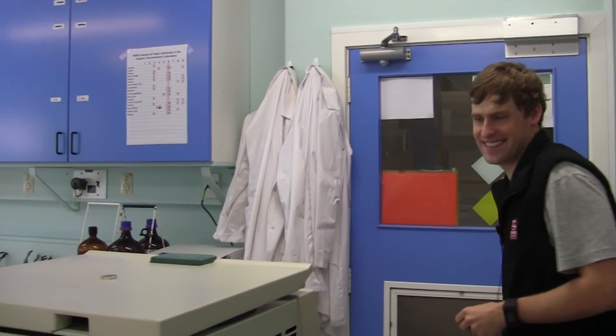Welcome to our organic geochemistry laboratory. Here we can look in detail at pigment composition.